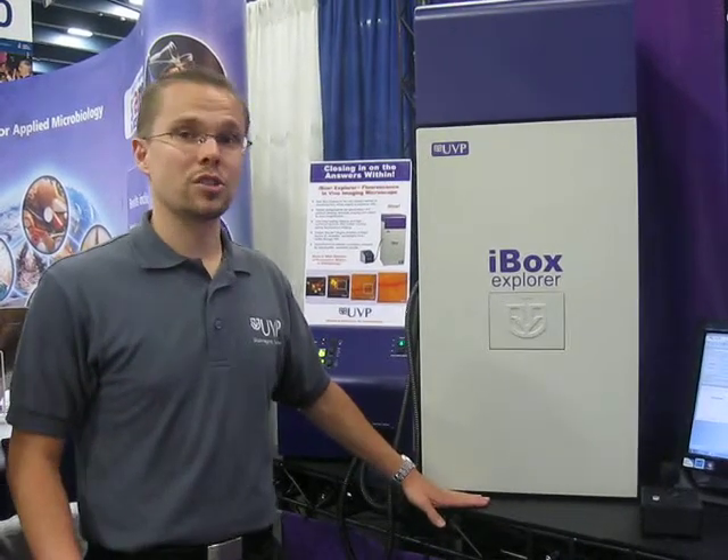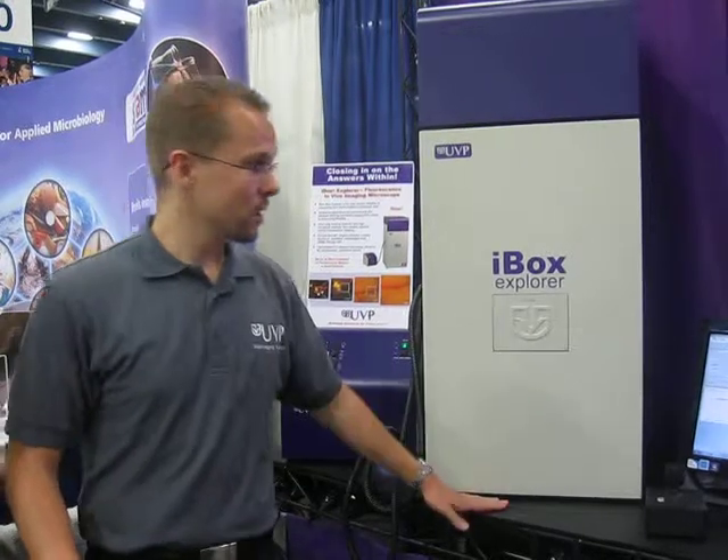The system's main applications are for small animal imaging, from whole animal down to single cell within the animal. So for all of your in vivo imaging needs as far as microscopy is concerned, feel free to take a look at the iBox Explorer Imaging Microscope from UVP. Thank you.